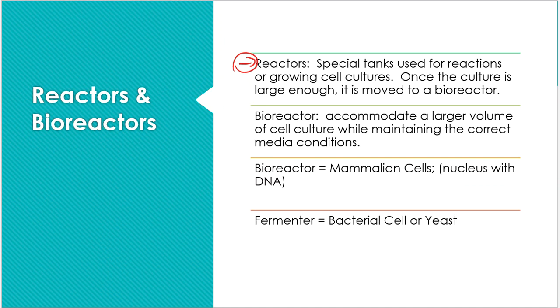So once we get so much, it is transferred into a different container, and that different container is another reactor, but that reactor is going to be doing stuff. Because of that, that reactor is called a bioreactor. And that's what this down here is basically saying. Listen, a bioreactor is going to be a vat, and that is going to create this kind of synthesis that you need in order to make a product.